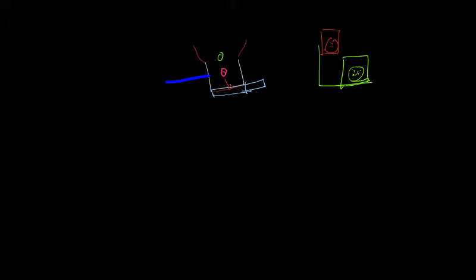A nozzle is a device which has an orifice, and the cells exit through the nozzle. Why do we put the nozzle here? If we don't have anything, it could be a thick stream of sample coming out, and we won't have control over the stream.